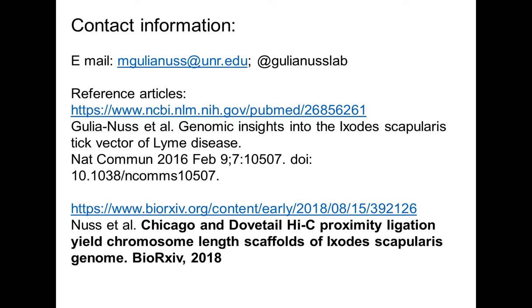So PacBio is one of the options for building the initial draft assembly. And if someone is looking at using PacBio, we really recommend around 60x coverage to get optimal results. We have done a bit lower. 50x coverage is probably acceptable, but anything below that, we'd probably not want to attempt.